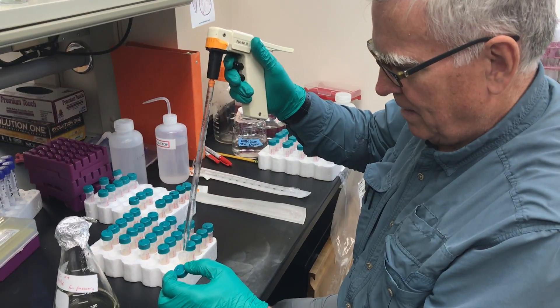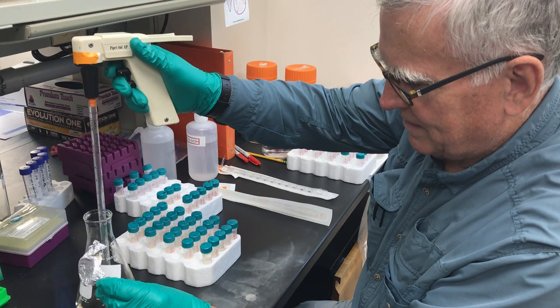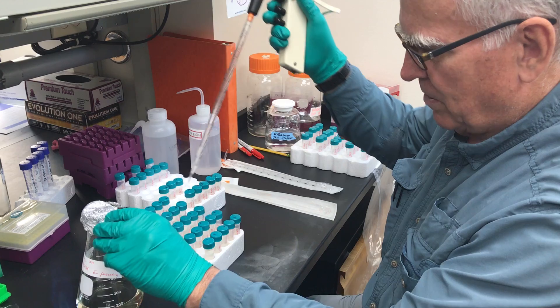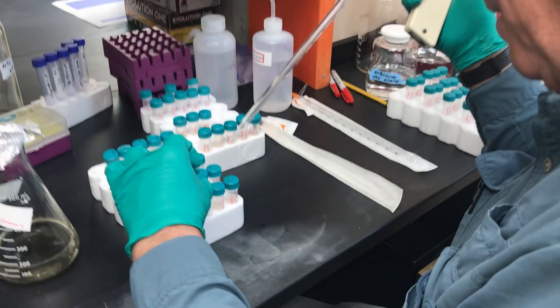I take off the top and I empty it — except I already filled that one. That's not good. So these things happen. Start again, do the next two. I already filled all of these. That was bad of me.